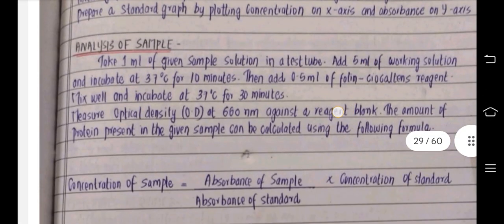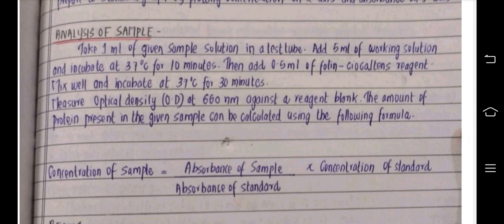In analysis of sample, take 1 ml of given sample solution in a test tube, add 5 ml of working solution and incubate at 37 degrees Celsius for 10 minutes. Then add 0.5 ml of Folin-Ciocalteu reagent, mix well and incubate at 37 degrees Celsius for 30 minutes. Measure optical density, OD, at 660 nanometer against a reagent blank.